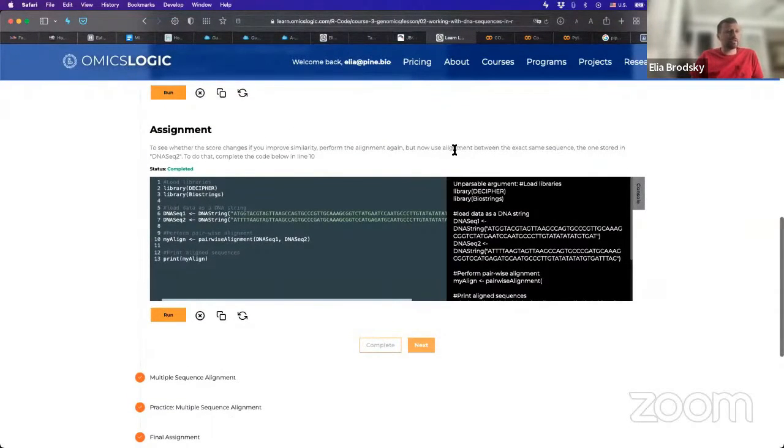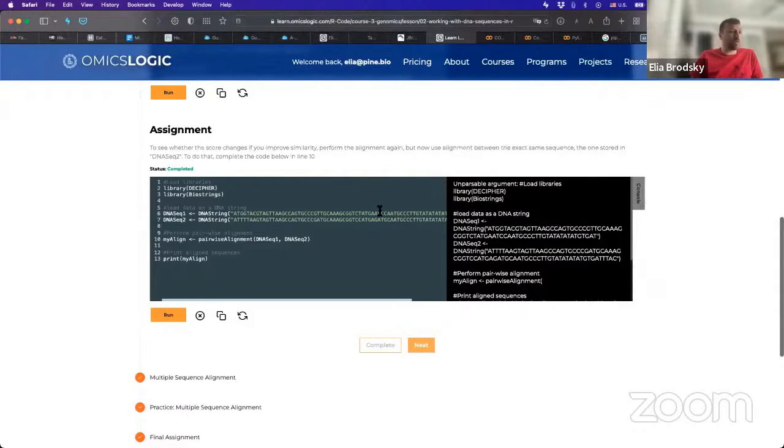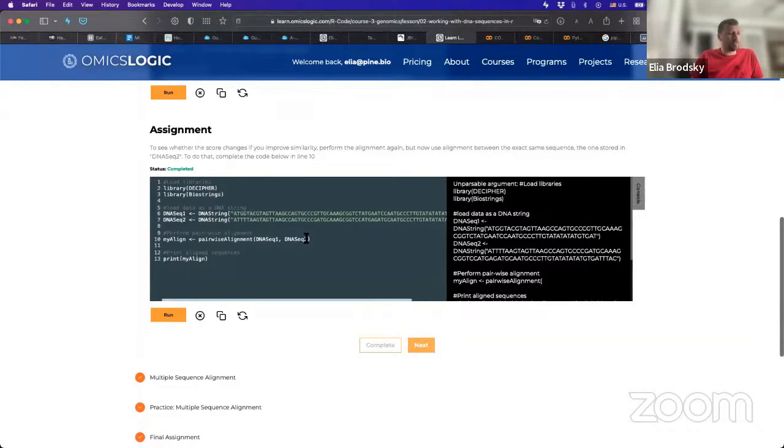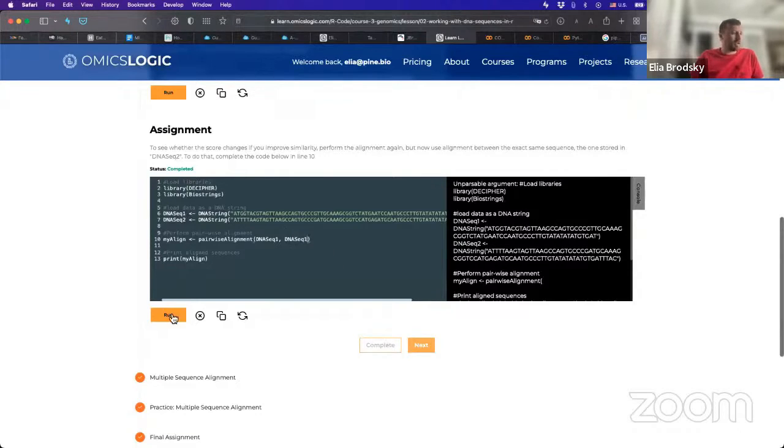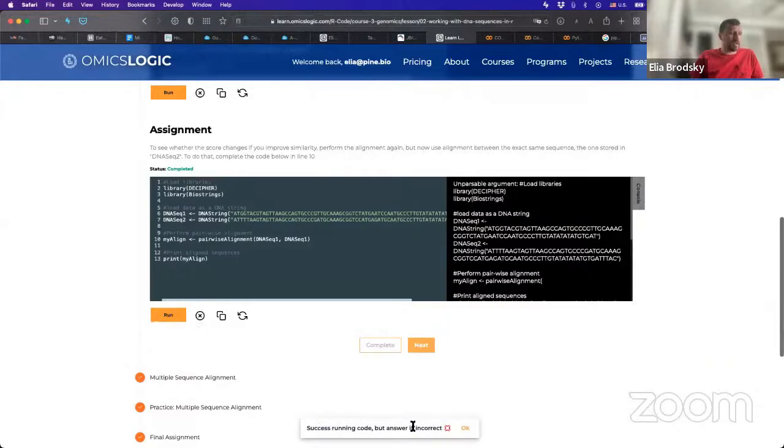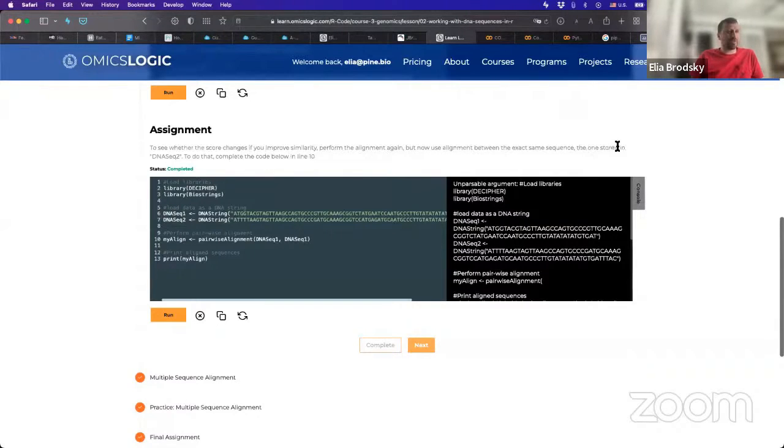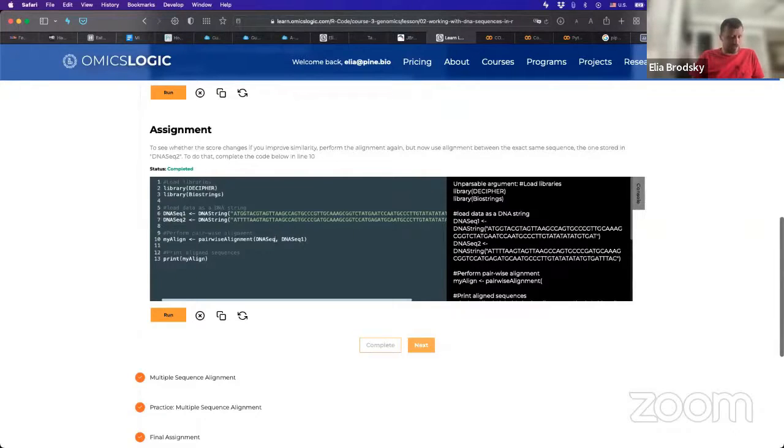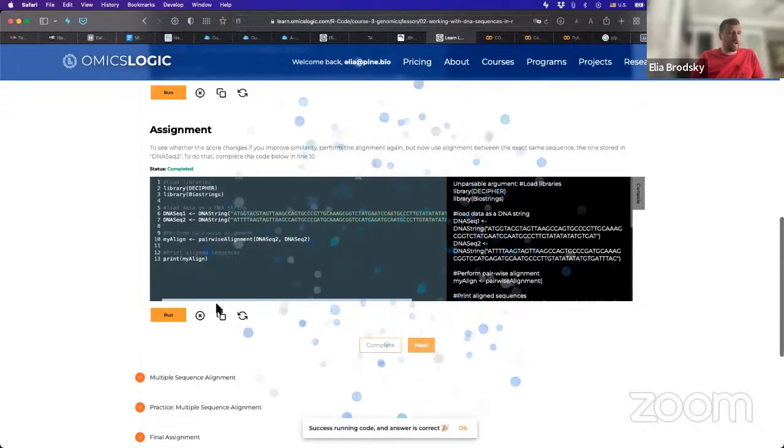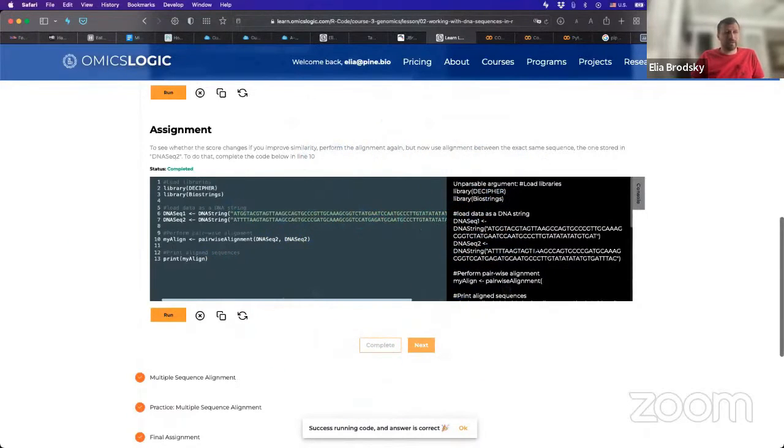Of course, it says, let's use alignment between the exact same sequence. How would we do that? Well, we could do that in two ways. One is we could copy the exact same thing. Or another one, because we have two objects, we can just compare the same object to itself. Right? And if we do that, let's run it again. And here again, something is incorrect. Okay? And why? Because it says the one stored in dna-seq2. So now let's change it to dna-seq2. Excellent. Now we have the correct answer. Okay?